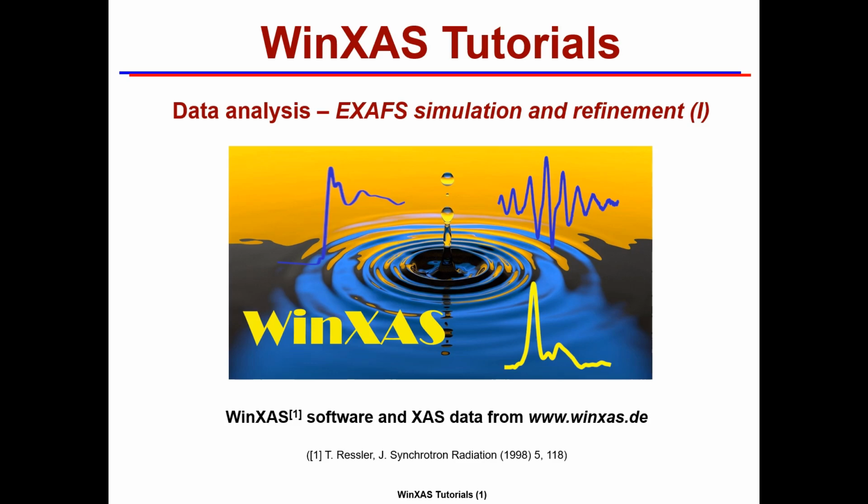This time I want to start talking about EXAFS analysis. I will be covering the basics of EXAFS analysis in 2 tutorials, probably followed by several more about specific examples and difficulties you may encounter while analyzing your own data. As always, the WinXAS software and the XAS data I will be using in the hands-on session can be obtained from the WinXAS website.